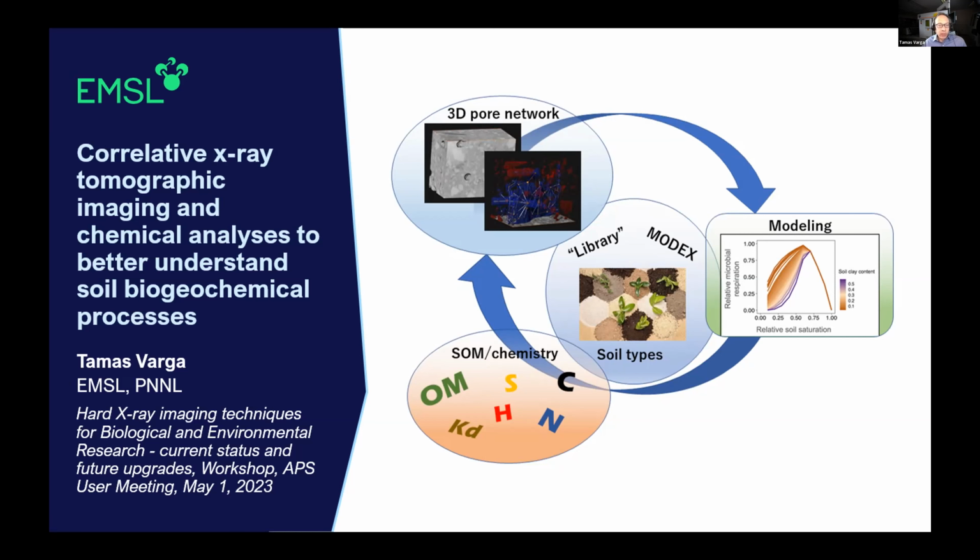So the idea here in the column experiment is this overview slide of the main idea behind the organic matter composition in the pores. This curve is a leaching curve that we get from the column experiment. Here the carbon concentration is plotted versus pore water volume, which is on the time axis. With different colors, we have 4 different stop flow events that are carried out consecutively. I'm also showing the sampling points with numbers on this plot to indicate where we take effluent samples.